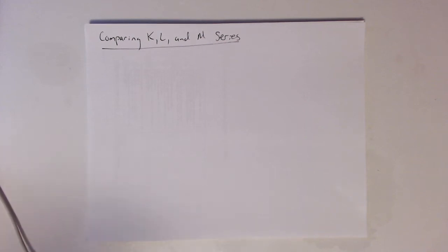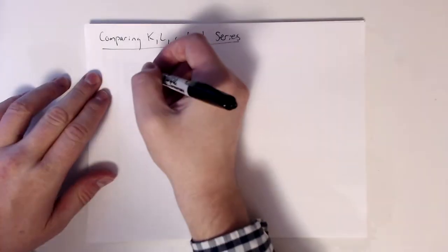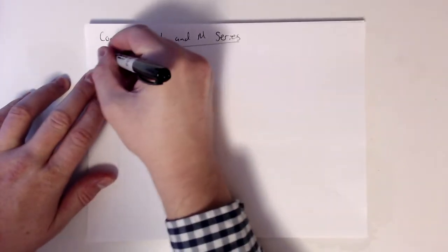All right, so now that we've talked about some of the different types of characteristic X-rays, I want to compare some of their characters, some of their properties. And to do that, we need to define a term, and that is the fluorescent yield.